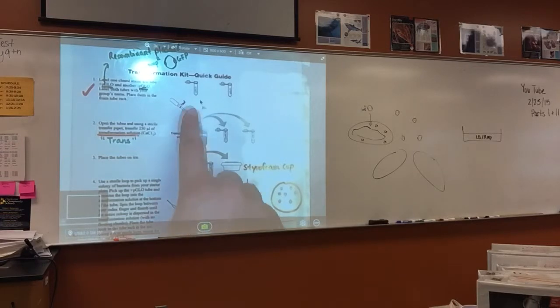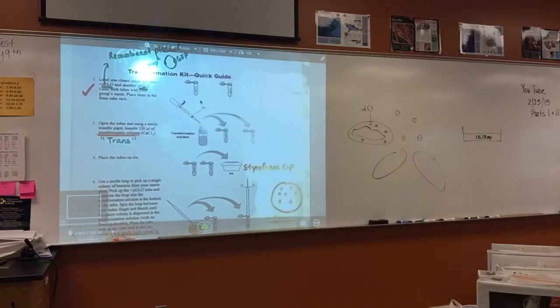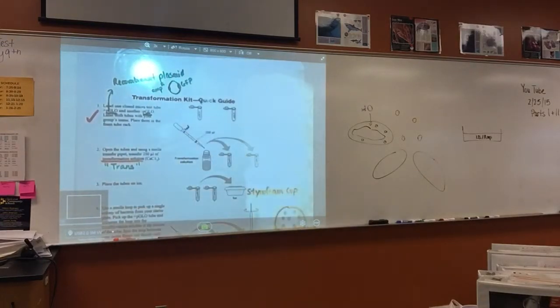So you're going to label one positive pGLO and one negative pGLO. So there's nothing in there yet. Positive pGLO means that tube will contain bacteria that is exposed to the recombinant plasmid. The pGLO means that's the recombinant plasmid. So that's what I wrote up here. And then the negative test tube, you're going to put bacteria in, but you're not going to expose it to the recombinant plasmid. So that's what the negative means, okay? You'll label those.